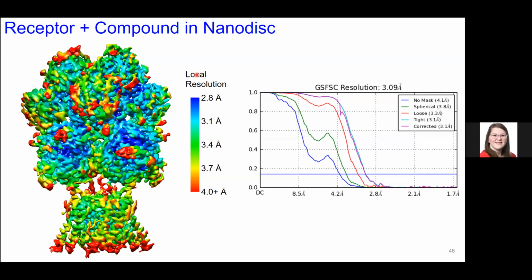All right, the next question was, do you think this would work well, skipping 2D, with samples with less recognizable features that are harder to align?